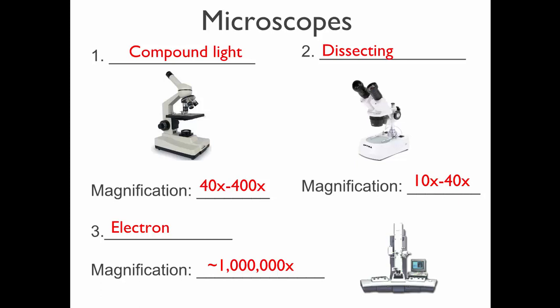So typically, you might see them here and there at high schools. Whitesboro High School has an electron microscope. I was able to use it. They got a grant to purchase their electron microscope, so I went to a workshop there, and we got to use it, and I brought an owl's feather, and this was the electron microscope image I took. So we'll talk a little bit about the differences between the types of microscope here in a minute.